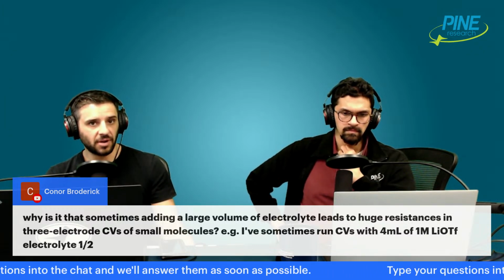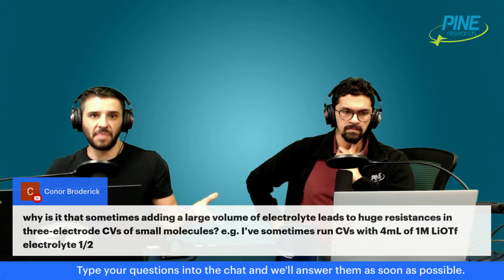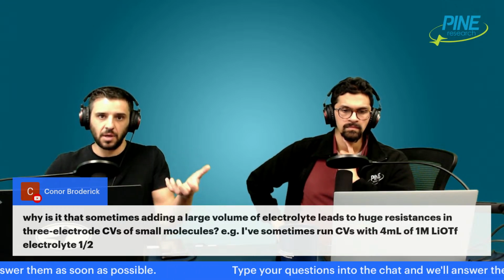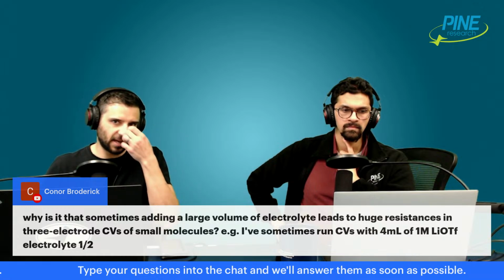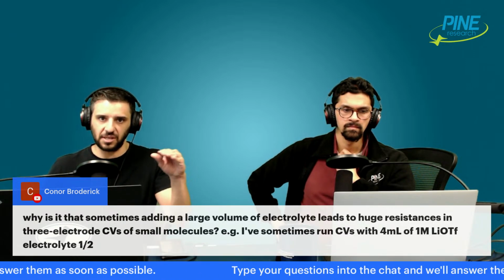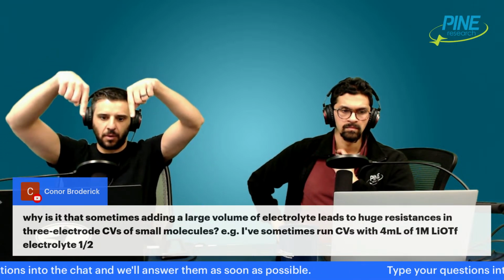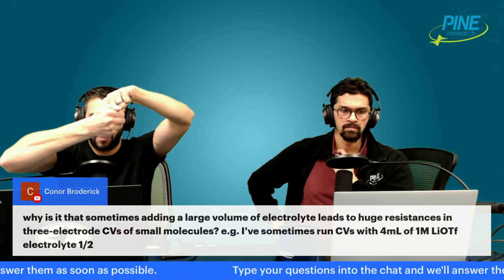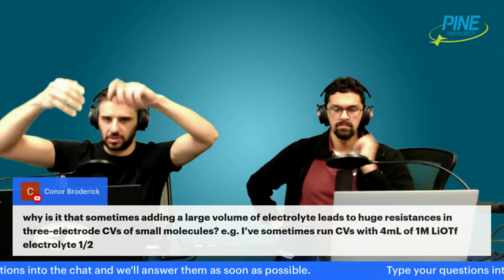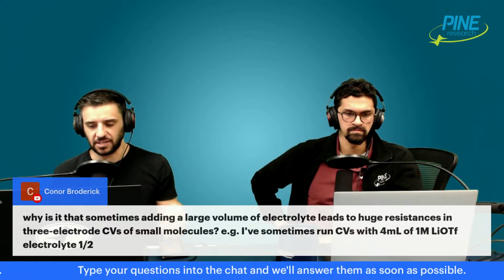When I was in graduate school, I did some tests where I had to use a liquid setup just similar to this, with lithium metal as the reference or the counter. I had to literally wrap and physically hug the electrode with the lithium, because lithium metal, if you've used it, is very malleable. It bends and folds and everything. It's not like a piece of steel. It's very flexible. So instead of dunking lithium metal and my working electrode in solution, I took the lithium metal and wrapped it around the working electrode, so it was touching as close as possible. Obviously not really, there was a membrane in between, like a piece of plastic or Celgard or something. But having them be physically close, and even then it didn't work that well.